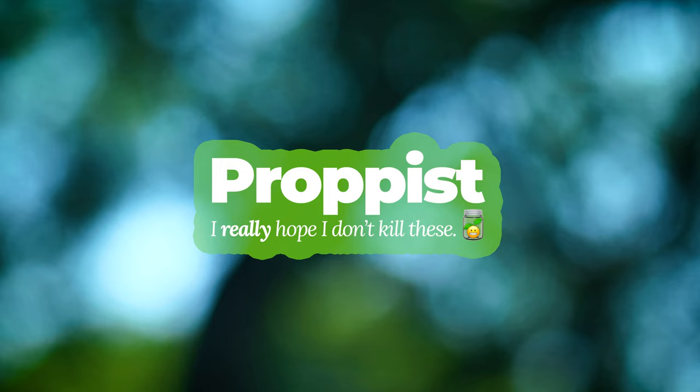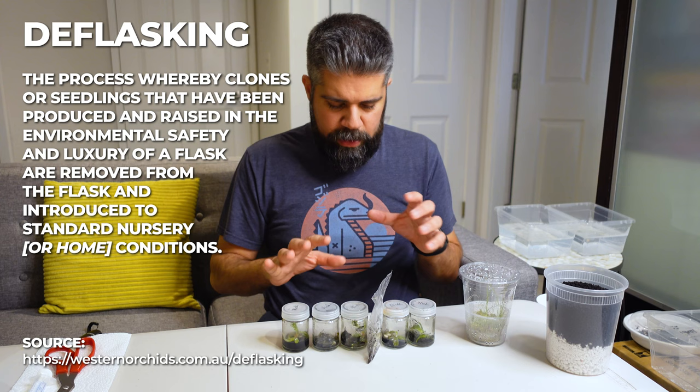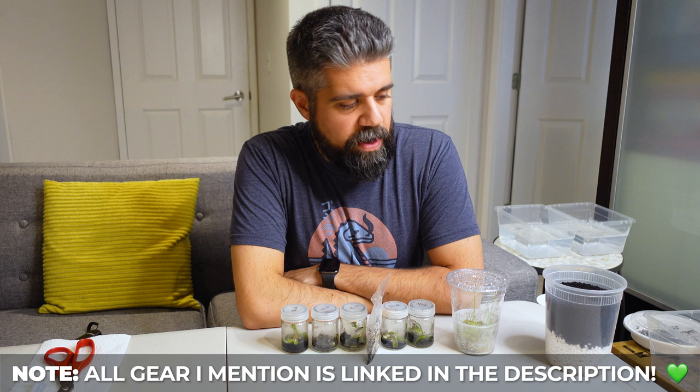Hey, planty people. This is Nick from Propist. I'm back with a completely different video today. We're going to be doing some tissue culture deflasking. I have for you today an interesting challenge — I'm going to deflask six plants that are currently in tissue culture. I've never done this before, so doing it on camera is a challenge, but at least it keeps me organized. Let's start by talking about all the equipment I've got here, and then we can walk into the actual process.